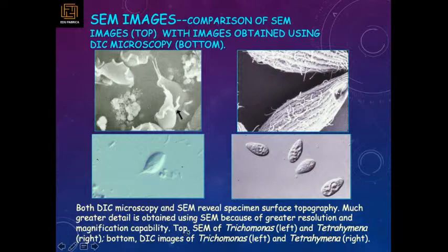So on the top left you can see the Trichomonas. On the left side you can see how 3D things are. Earlier we were seeing most of the images to be 2D, but in this we can see things to be more particular and more compact and very nicely.